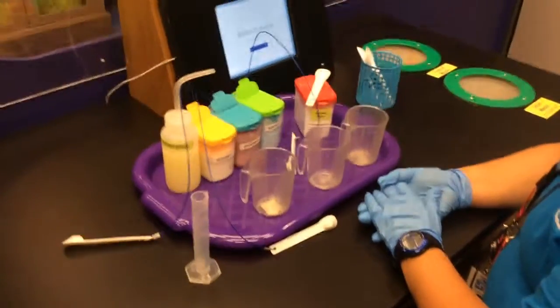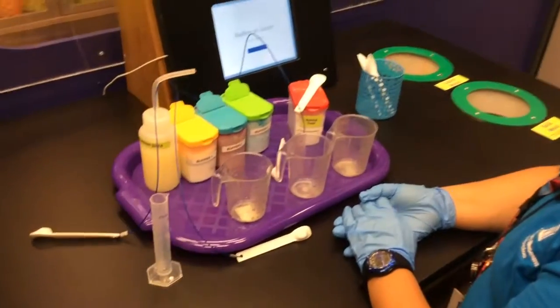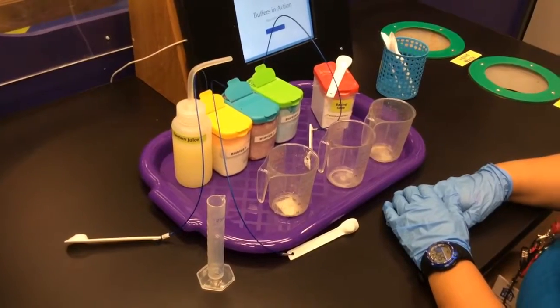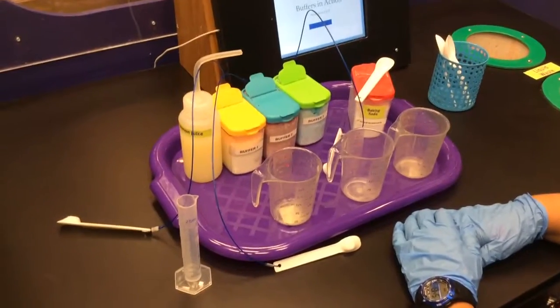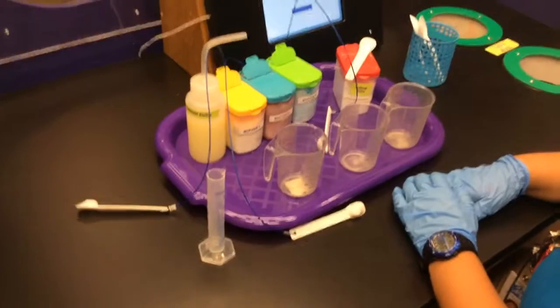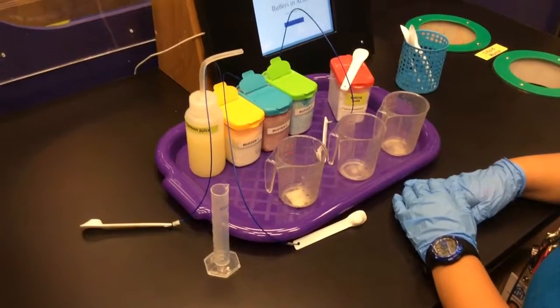This is Otis again, and what we have today, we're going to be demonstrating our buffers in action experiment. Our first video was just some background information on what is an acid, base, and a buffer. Now we're actually going to test out three different buffer chemicals, and what we want to do is determine which one is the best buffer.